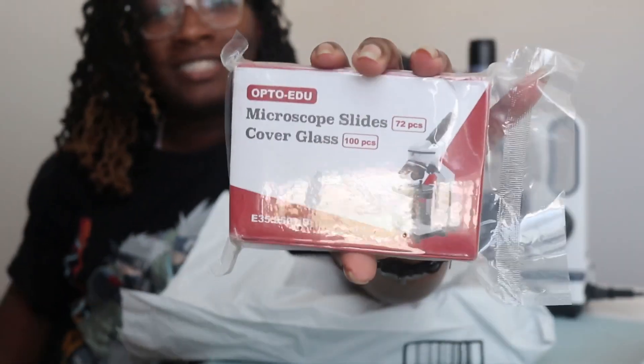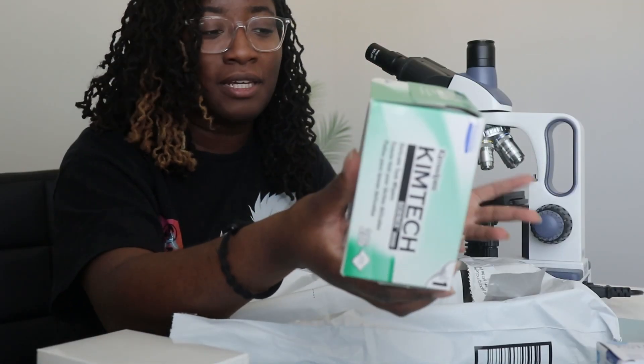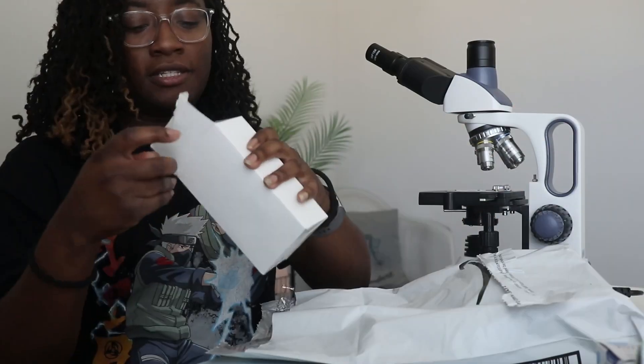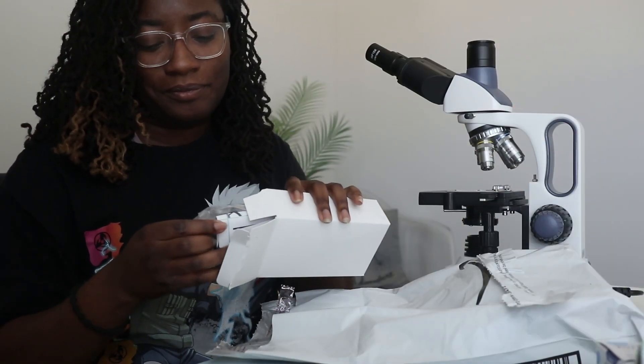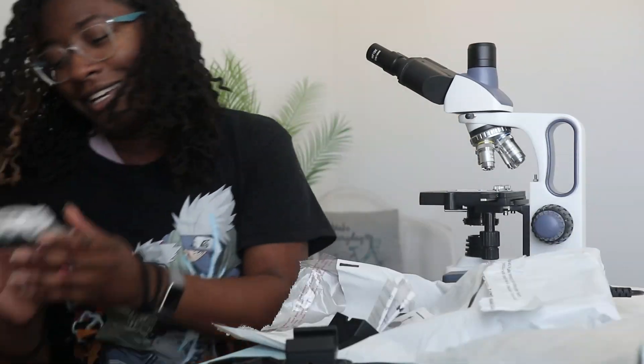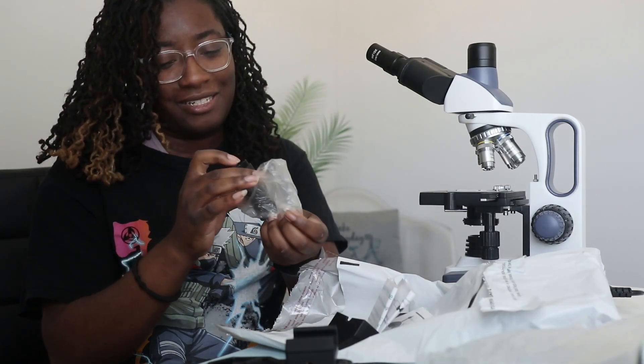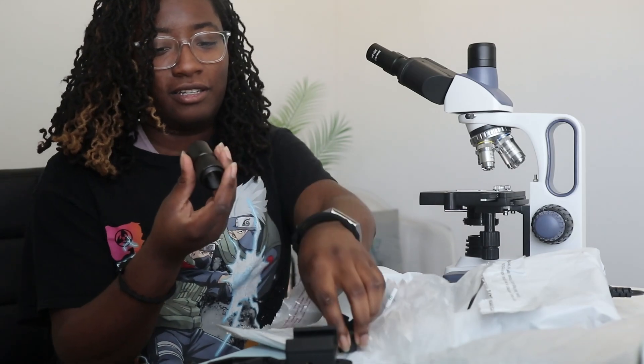The first thing I bought were slides with cover slips. I did get alcohol wipes since I'll have to use immersion oil. I also got chem wipes to clean lenses as well. This is supposed to be a phone holder so I can prop my phone up on the objective. And here's my other lens — it did come with a third lens for the microscope.